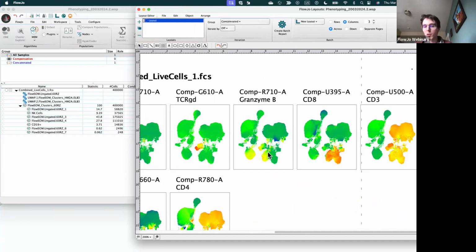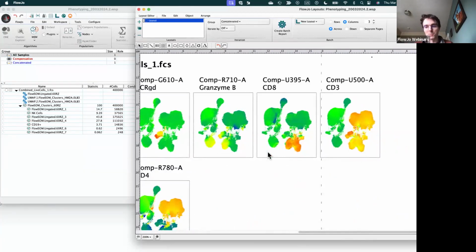So bear with me if I call something an activated population and maybe there's more nuance than what I'm really describing, or I called that an NK population, but I just used granzyme B. Obviously, we can maybe use better definitions to define those cells or more markers. But for this webinar, I think we're just trying to get the broad idea of what these populations are, and we can always verify it further with looking deeper at the marker expression.